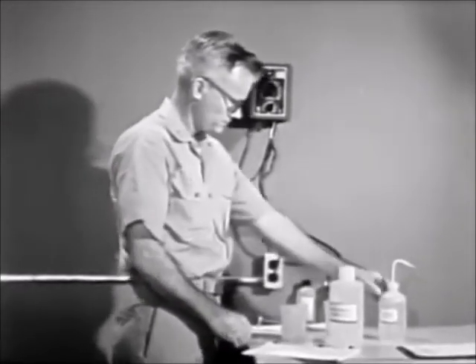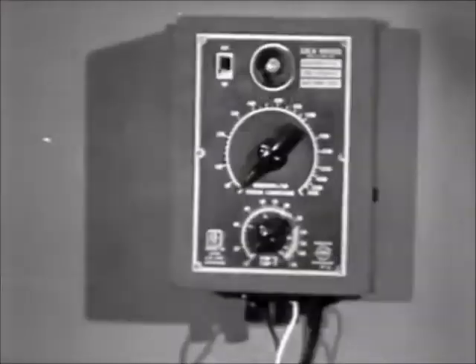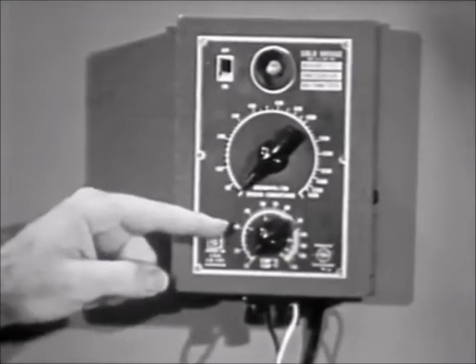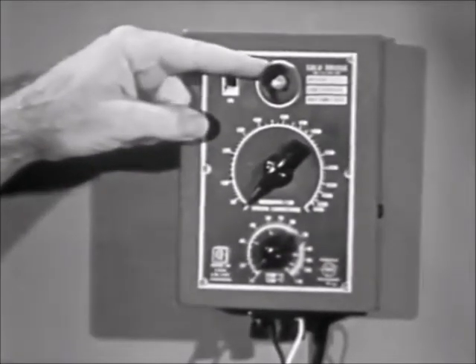The conductivity meter must be connected to a 110 volt AC outlet. The meter contains a Wheatstone bridge as its measuring circuit, a manual temperature compensator, and a cathode ray tube as its balance indicator, controlled by the upper dial.